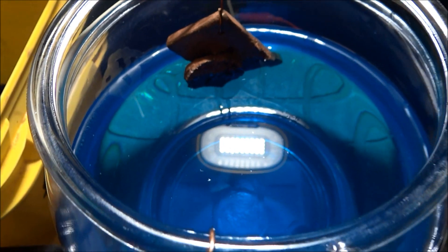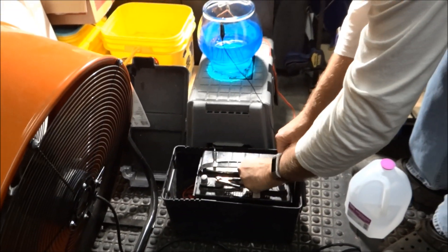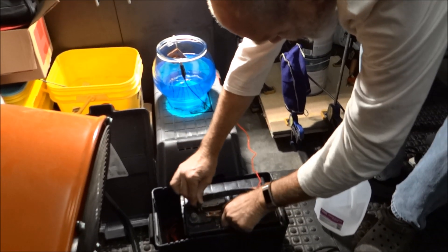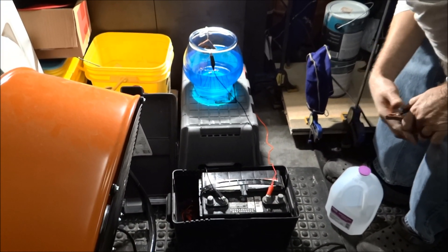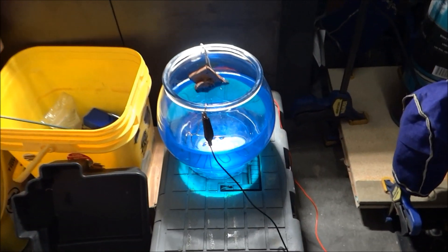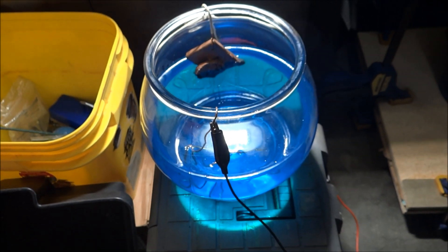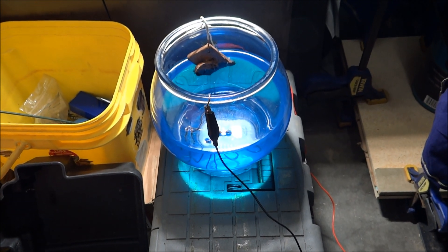Step back, babe, while I fire this thing up. We're going to put the anode on positive and that one on there. I don't know how long it's going to take - forever? I think you're supposed to eventually see some bubbling coming from either the anode or the copper, but anyway we'll grab the camera if something cool happens.